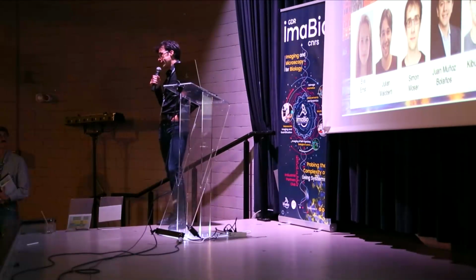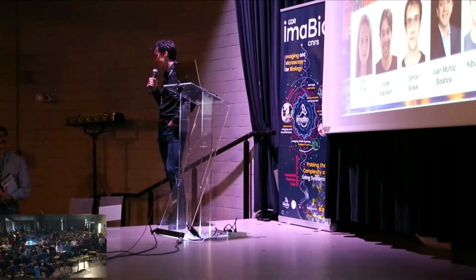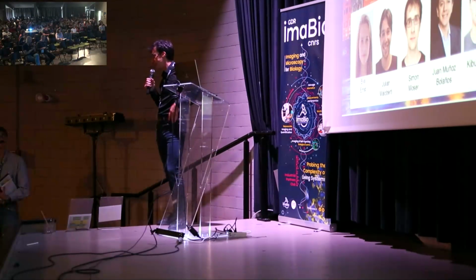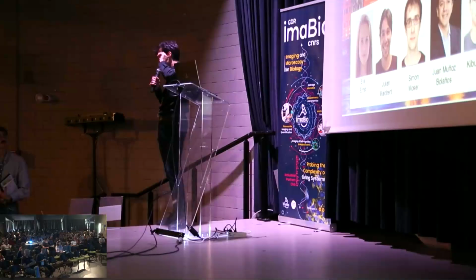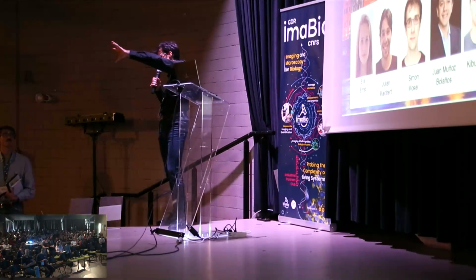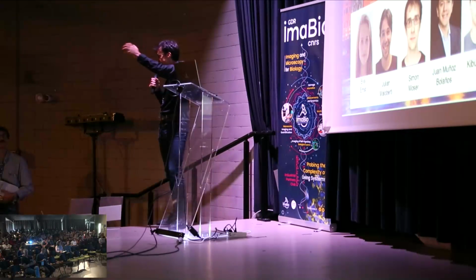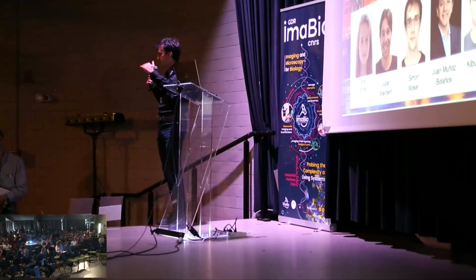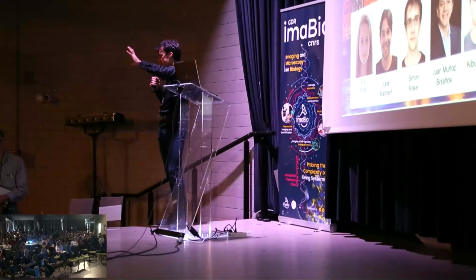Yeah, there is one effect. That's a good question, actually, because there is limited control of where the focus will actually form once it's corrected. Because you also need a kind of guide star, even if you do multiphoton imaging. But what happens in the very first measurements is you have a speckle pattern on your sample, and the brightest speckle simply wins. So the first few measurements are pretty uncertain. You don't really get nice sinusoidal signal excursions. It is just the speckles fighting.